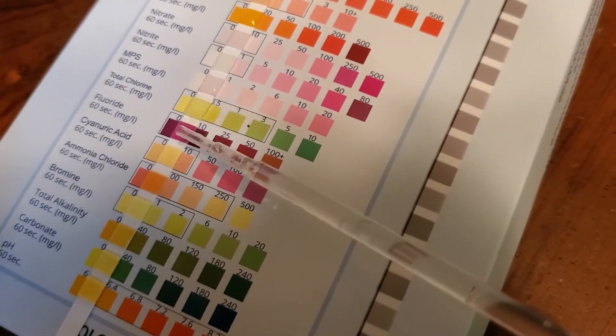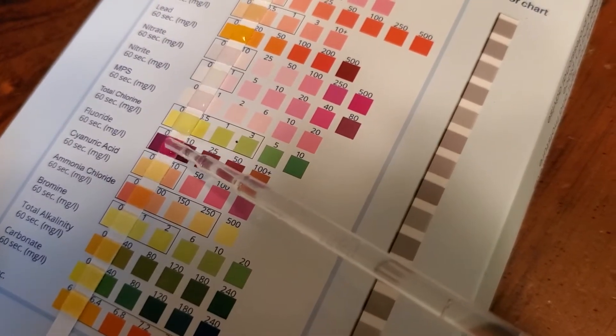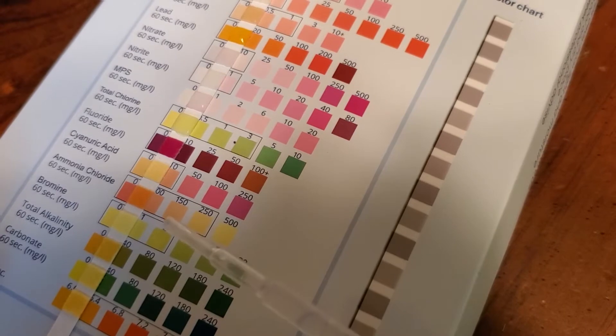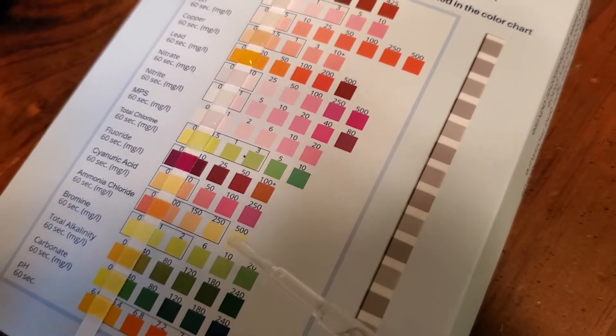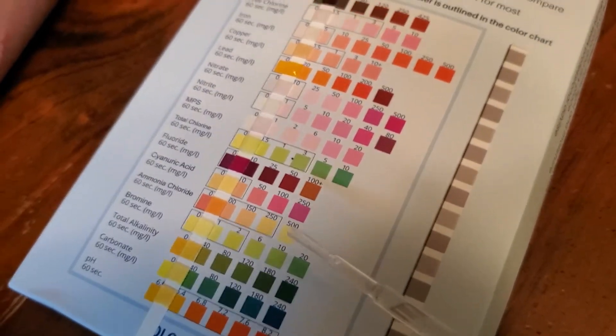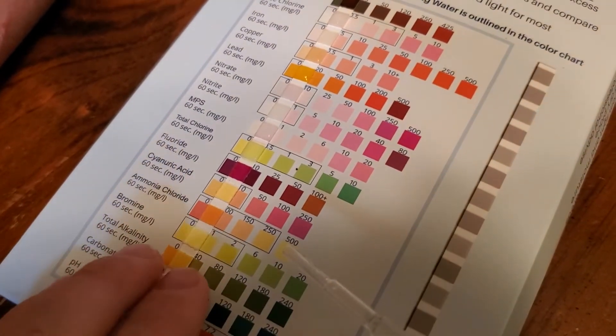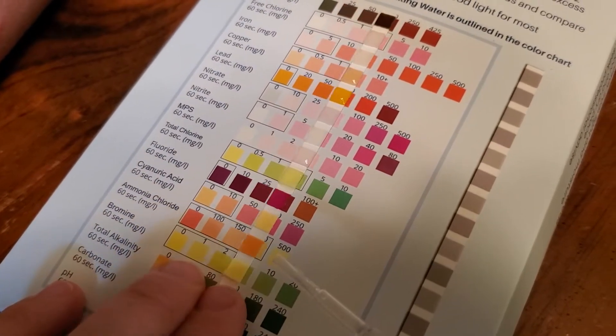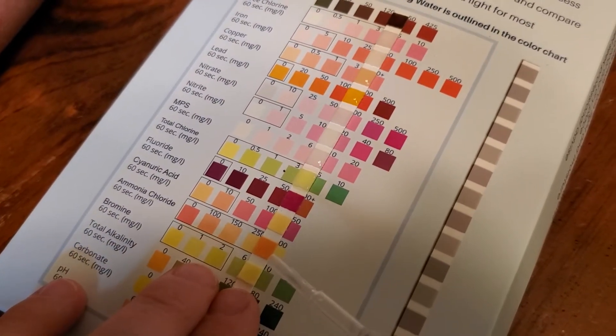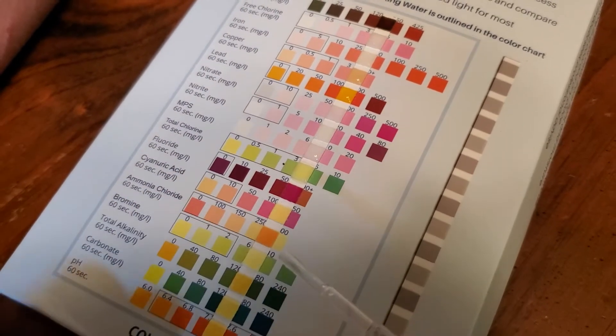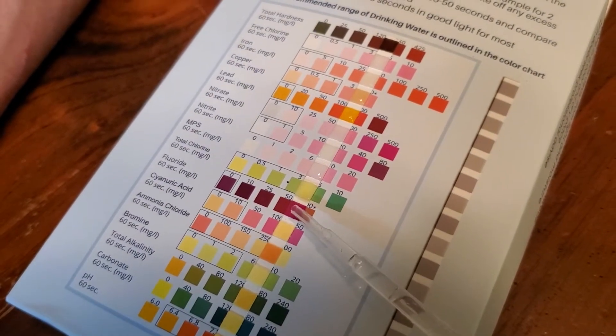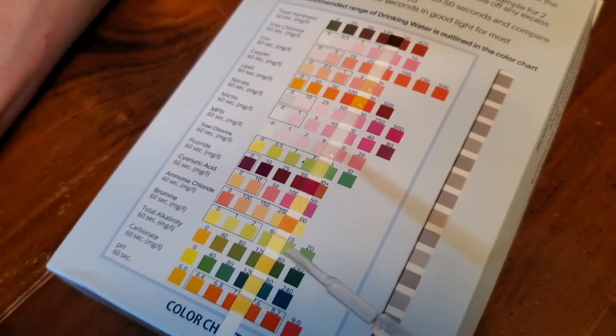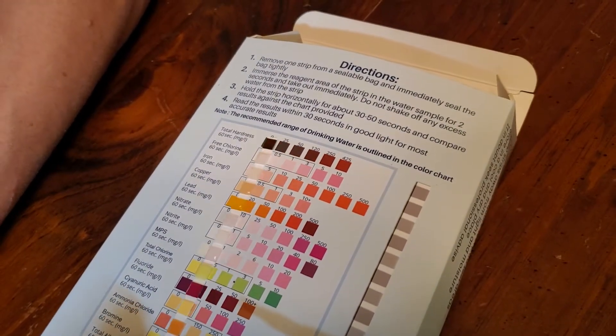Fluoride. Allegedly there's no fluoride in the water here. I thought fluoride was good for you. It is good for you but too much fluoride is bad, and crazy people are scared of fluoride. See that one's definitely darker than that, I mean lighter. It's like gotta be between those two. But it's not even the right color range. This is a brighter color. I don't know on that one. That's the problem with this thing, it's so untrustworthy.